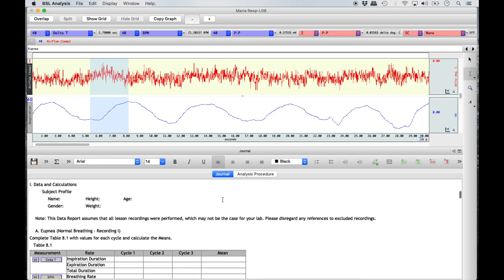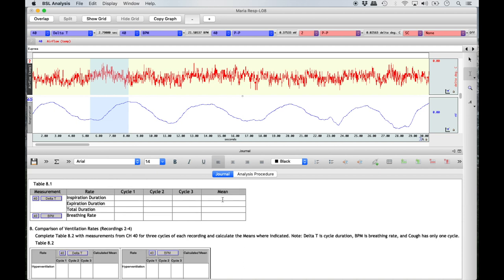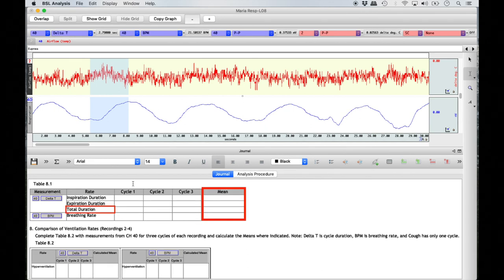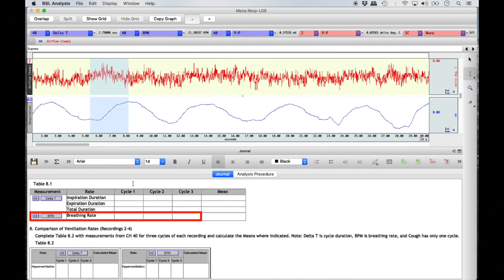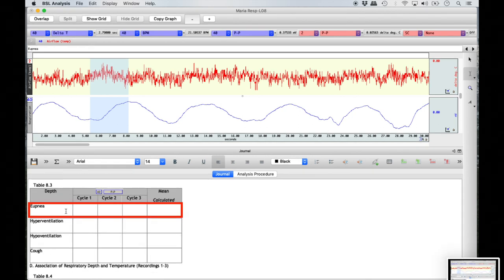Scroll down until Table 8.1 is in view in the journal section. For this table you will measure the inspiration and expiration durations separately for three different respiratory cycles within the eupnea recording segment only. You will then calculate the mean and total durations, as well as measure the breathing rate of each of the three breathing cycles using the BSL application. You will also be completing the first row of Table 8.3, which has a row for the eupnea condition.